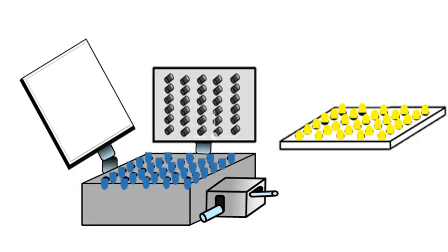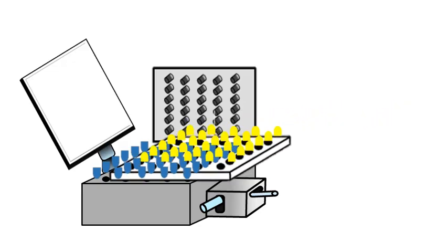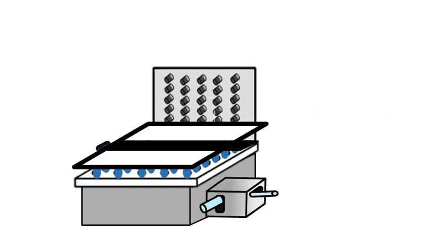Now lift the pin plate upwards in the original direction and move the lever upward so that the body of the capsule is uplifted in the bed. Now place the Loading Tray which has the caps on the body and lower the sealing plate and press it so that the cap of the capsule gets locked with the body of the capsule.